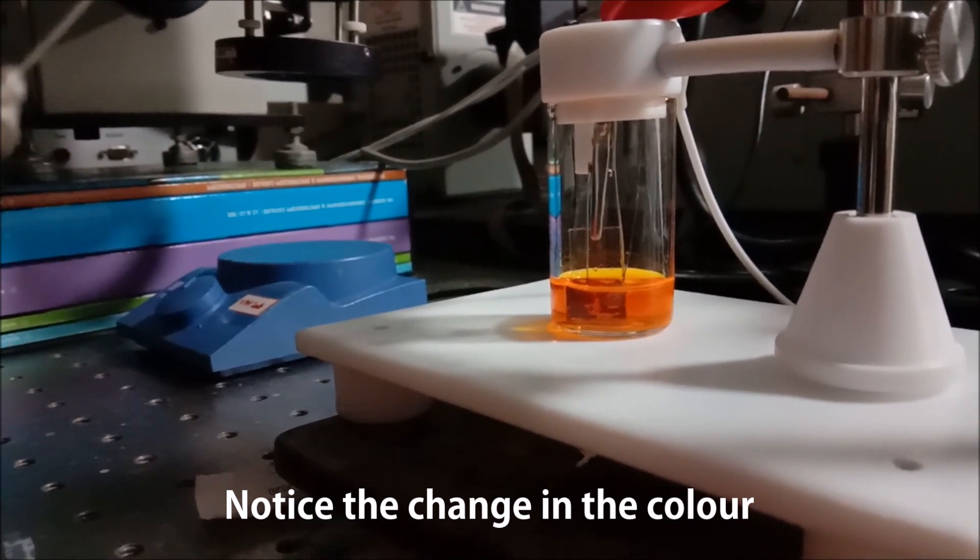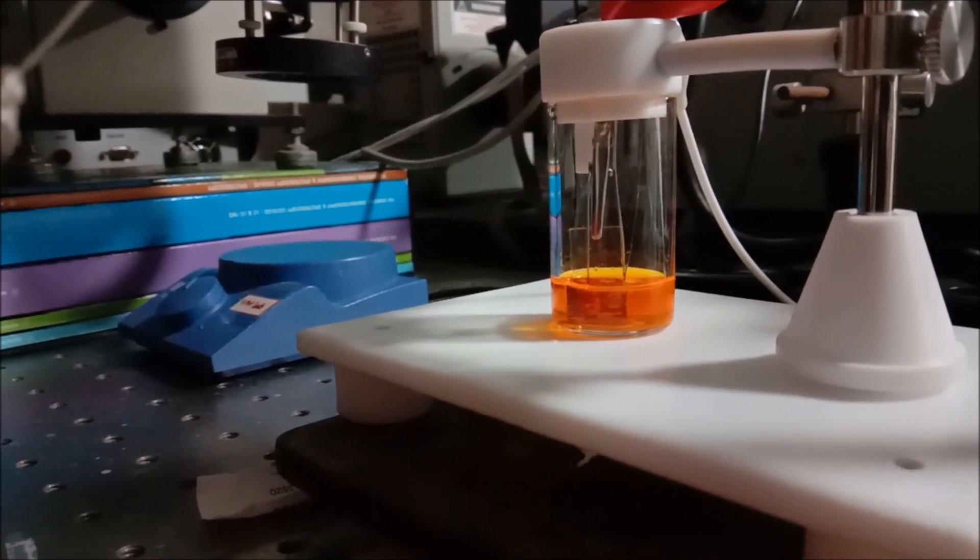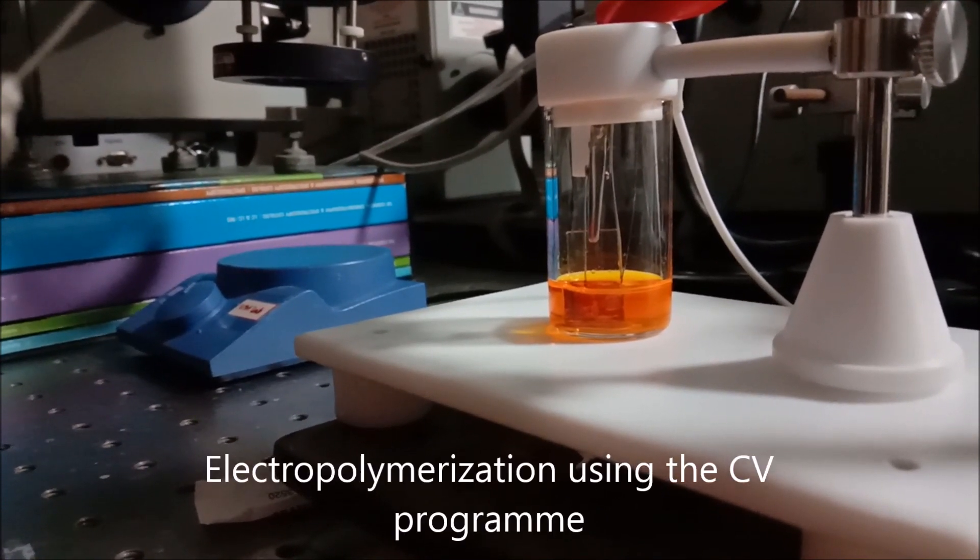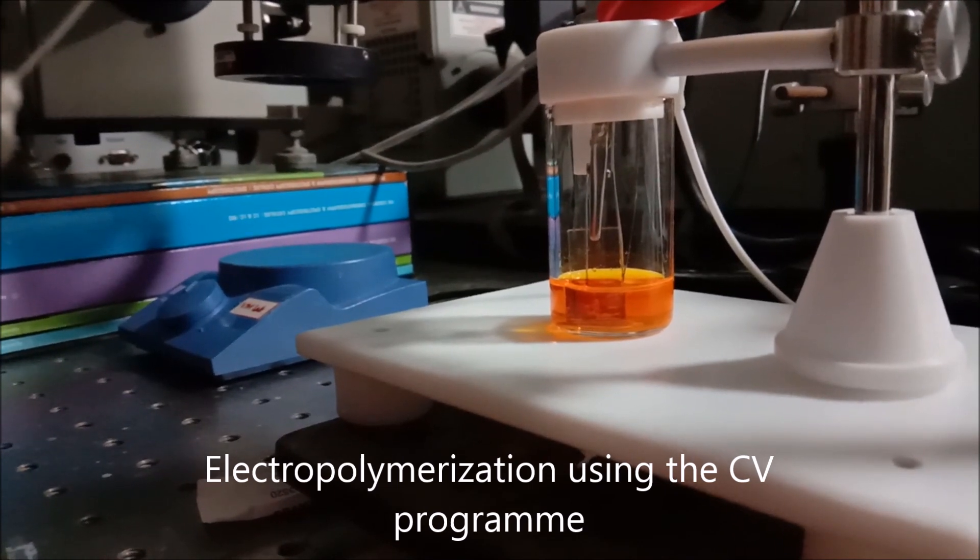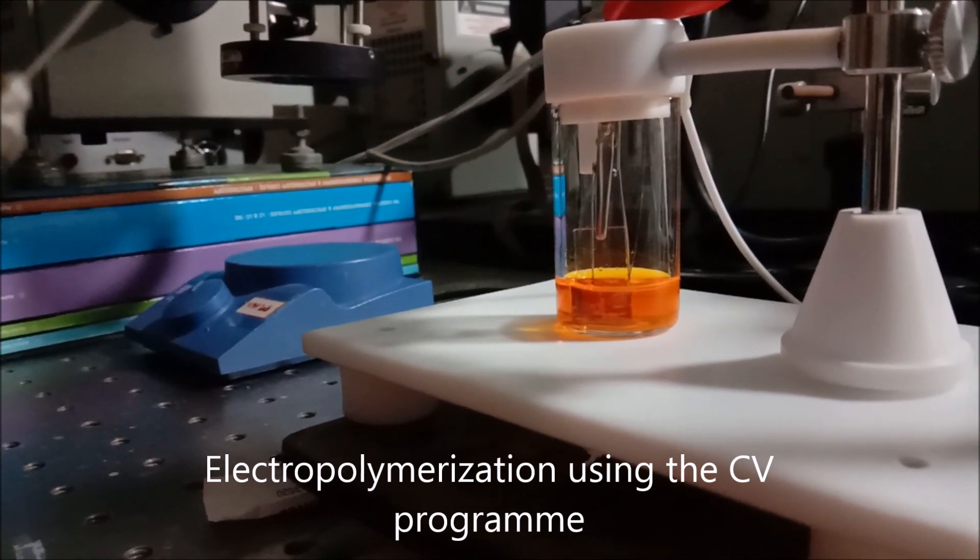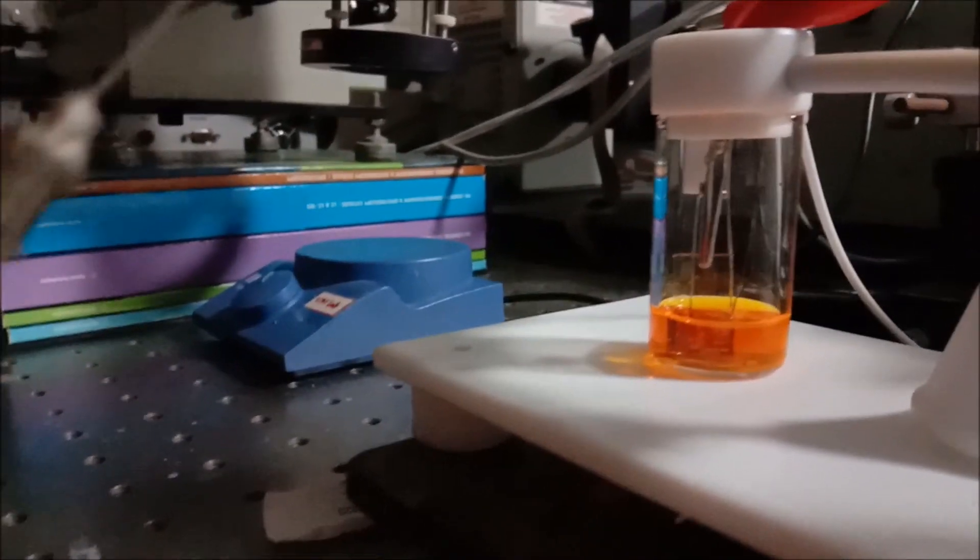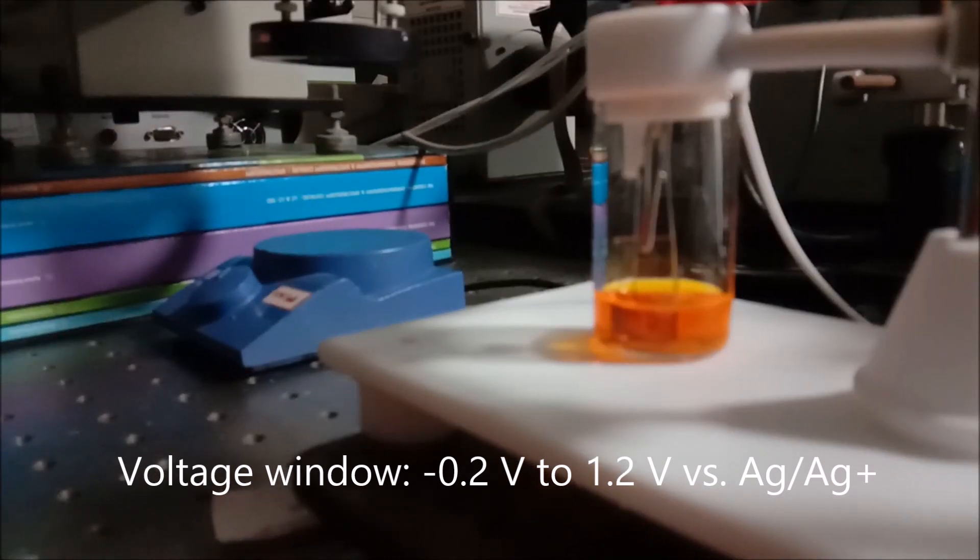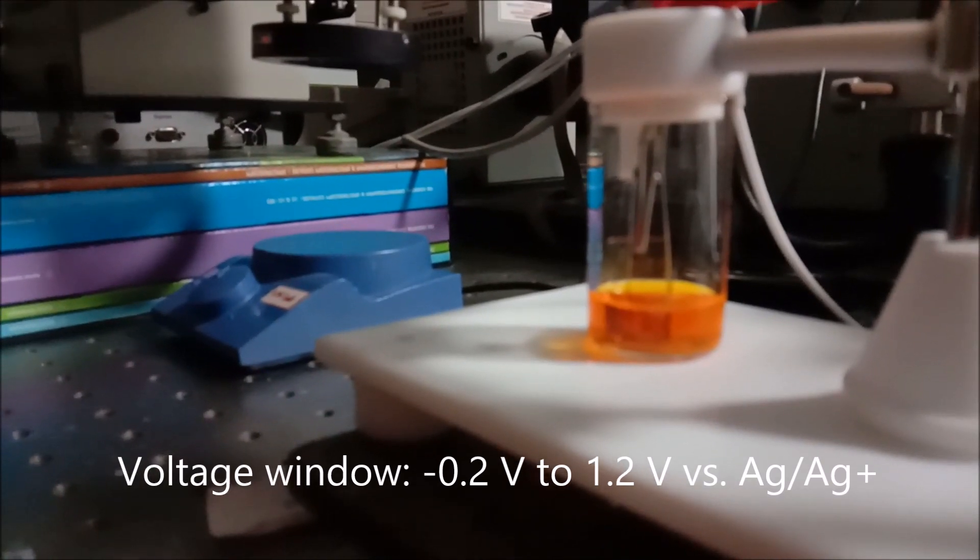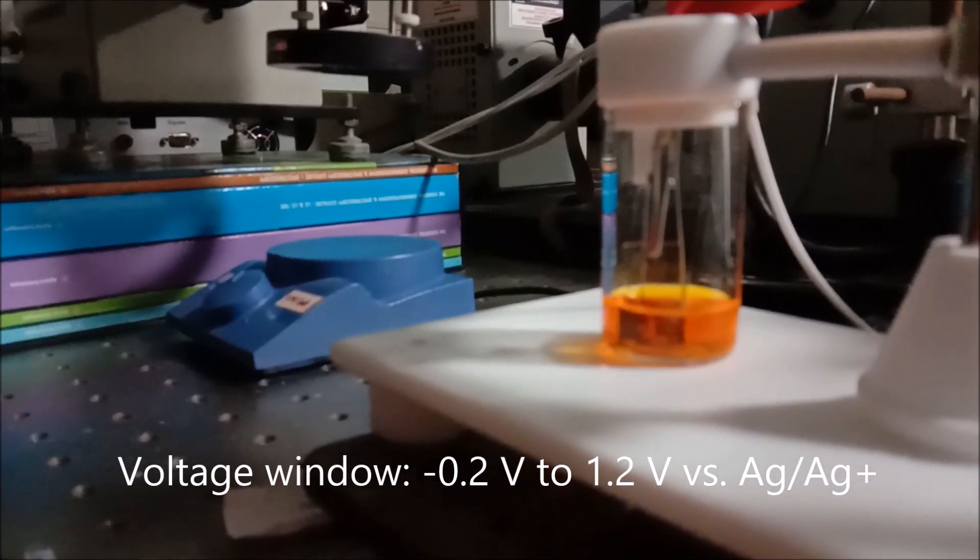We are doing electropolymerization on FTO substrate. Obviously I can't reveal the material here. However, interestingly you can see that the blackness of the material being deposited on the FTO substrate immersed in the electrolyte is increasing at a particular moment and then it is fading away.